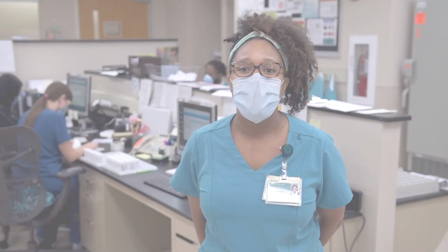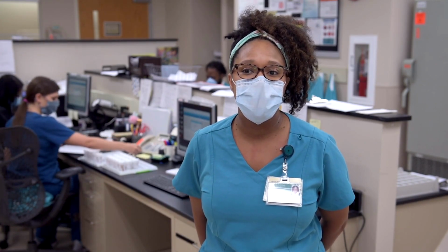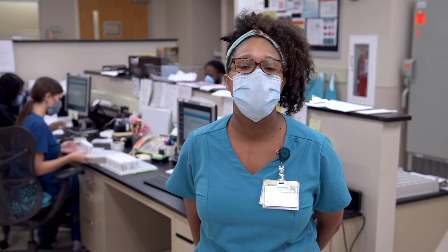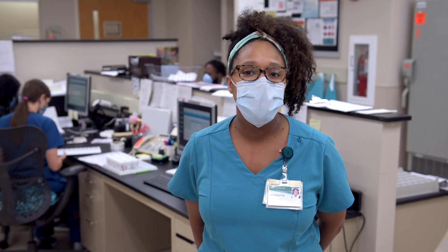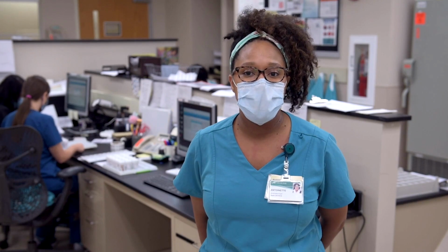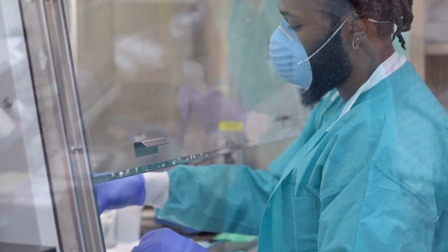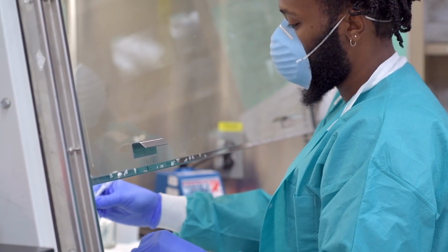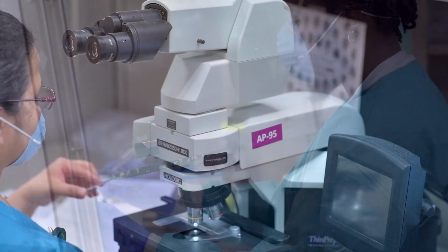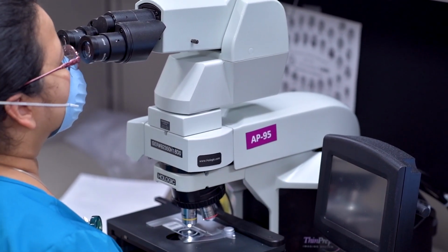Annually, the Cytopathology service receives about 15,000 pap smears. Additionally, we receive close to 8,000 non-gynecological specimens to include pulmonary, urine, cerebrospinal fluid, bone, breast, and additionally GI specimens. When a specimen comes to the lab, we begin in the cytopathology processing area. Next, they will go to the screening area to be screened by a cytotechnologist, and then finally to the Signout Room to be screened by a pathologist, fellow, and resident.